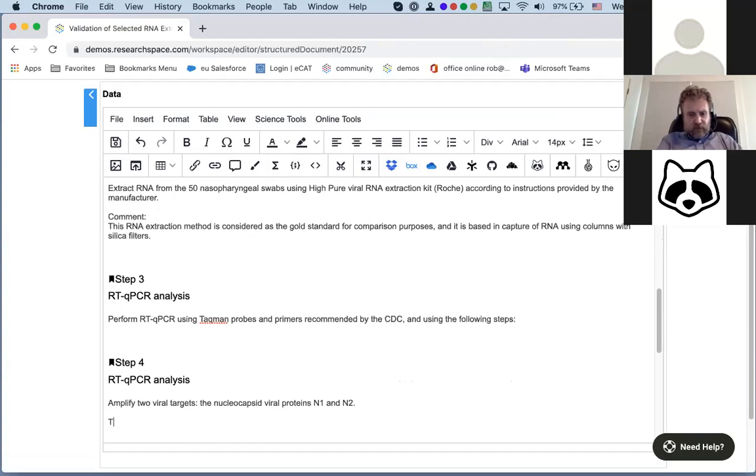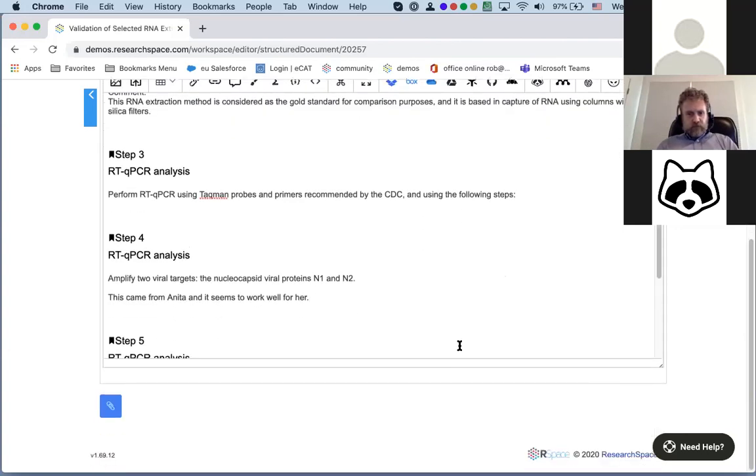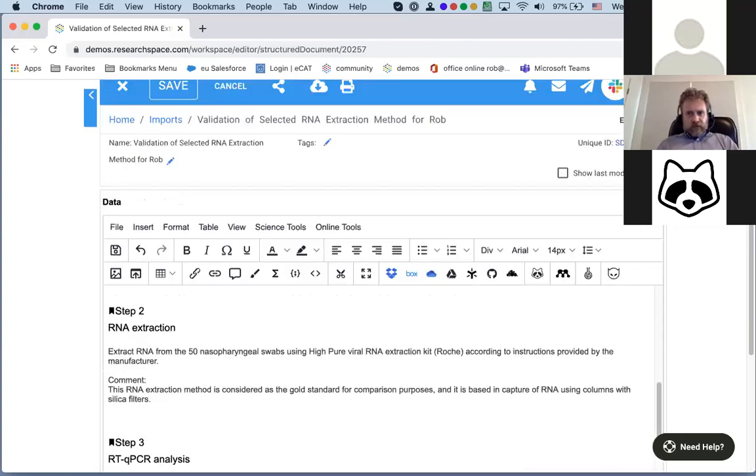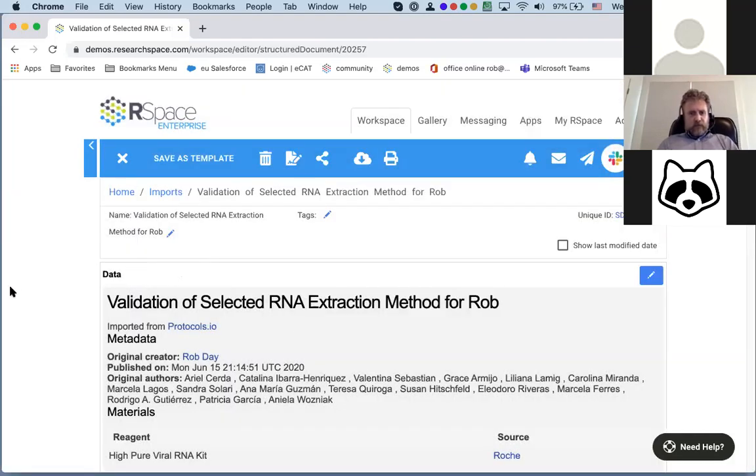So I could say this came from Anita and it seems to work well for her. And now I can save those changes by just saying save here.